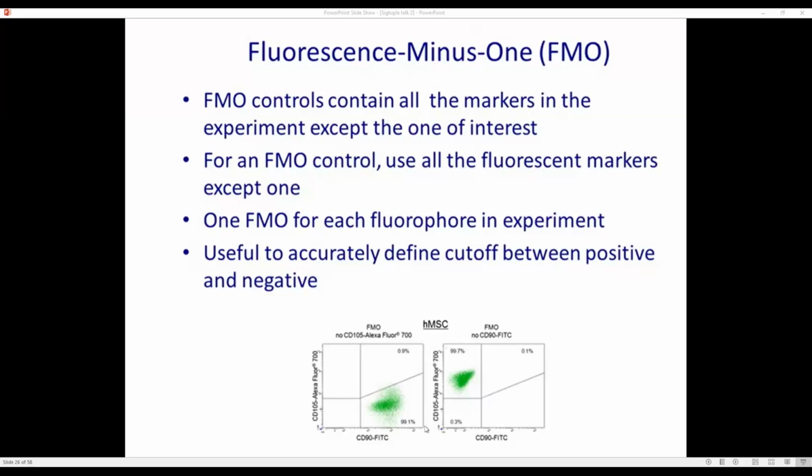Dr. Thulasi, there's a question on the chat. Yes. Is it acceptable to generate a single 10-color compensation matrix and use it for all experiments, even those that utilize fewer than 10 colors? Or is it preferable to create experiment-specific compensation matrices? Example, one for TB NK panel and another for the lymphoma panel. Excellent. Very good question.